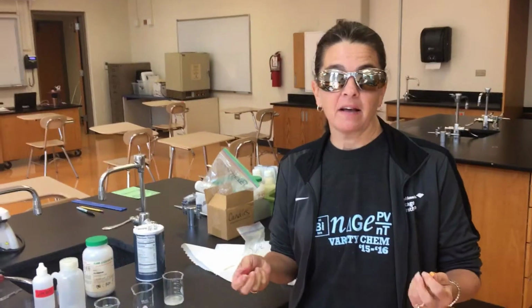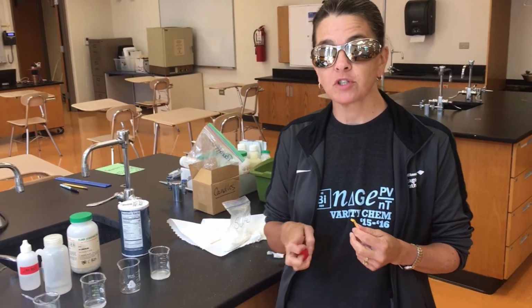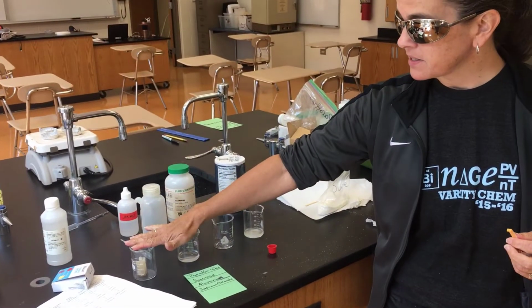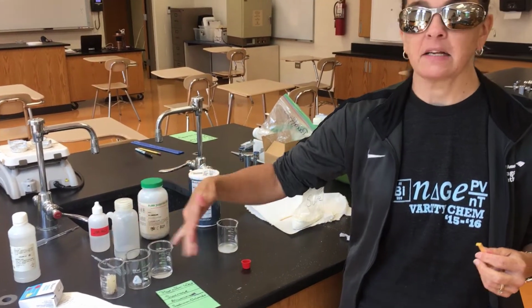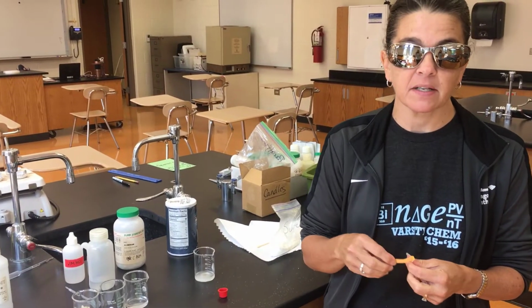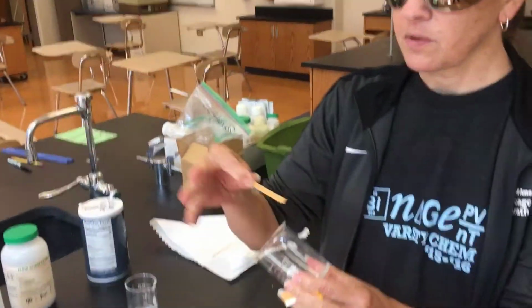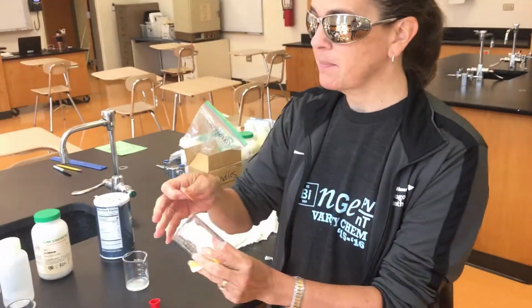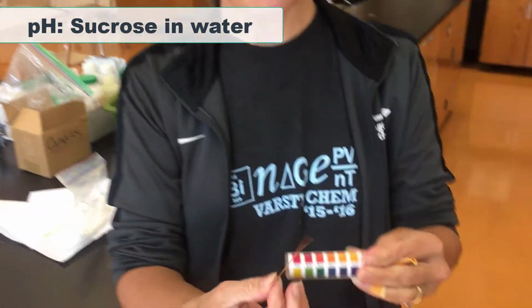Okay, now that we have solutions, we can do one other test, and that is to test the pH of those solutions. Again, I'm not going to test the pH of my known paraffin and my known aluminum because I can't dissolve those, and since I can't dissolve them, they will not react in an acidic or basic way. But I can test my sucrose. So I will dip the pH paper in there, and I don't get a tremendously different result.